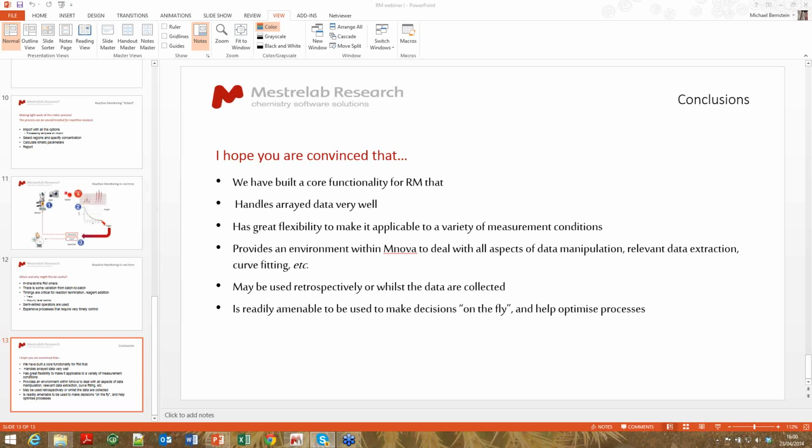Brian's asked, have you used the listener to send feedback to a spectrometer? Personally, I haven't, but I don't see any reason why a good person working at Bruker can't do that. Paul Tan, can you reset negative concentration data?